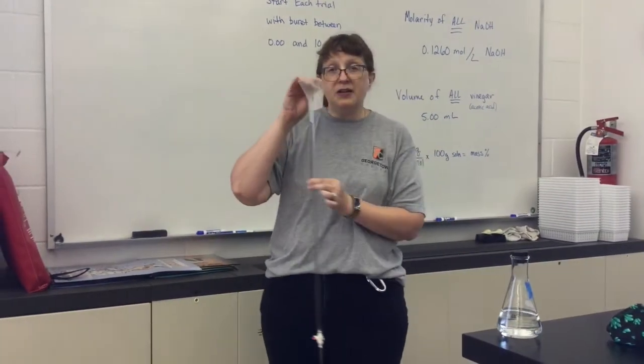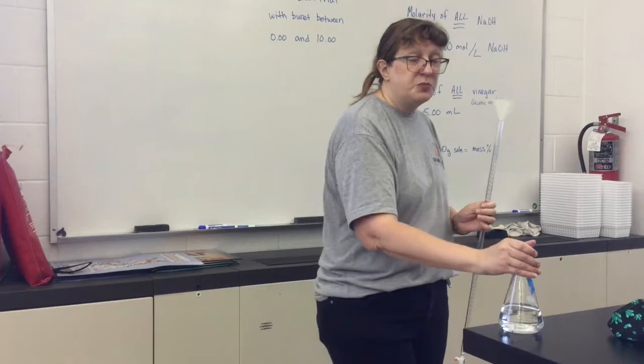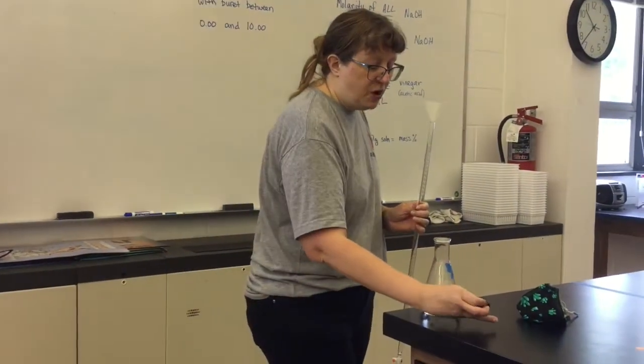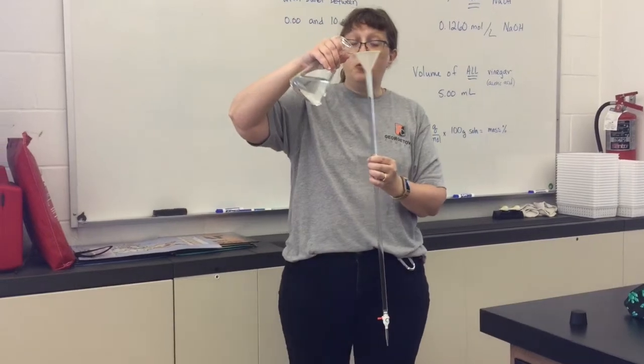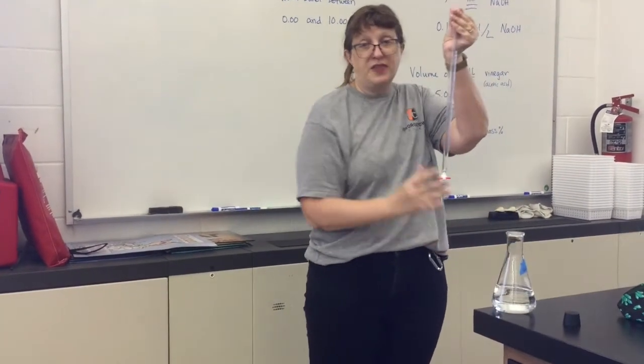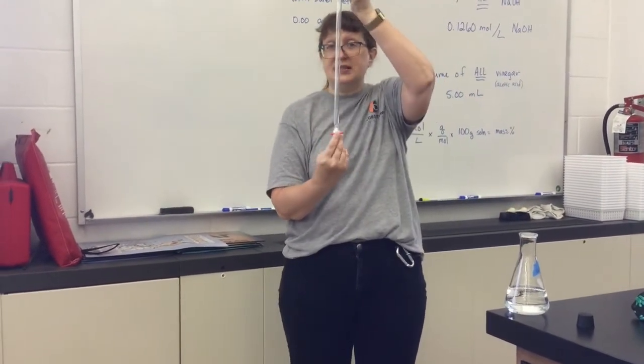Place a funnel in the top of the burette and then just put a few milliliters from your flask into the burette. Now before you pour, you're going to want to make sure that that stopcock is closed. It needs to be horizontal.